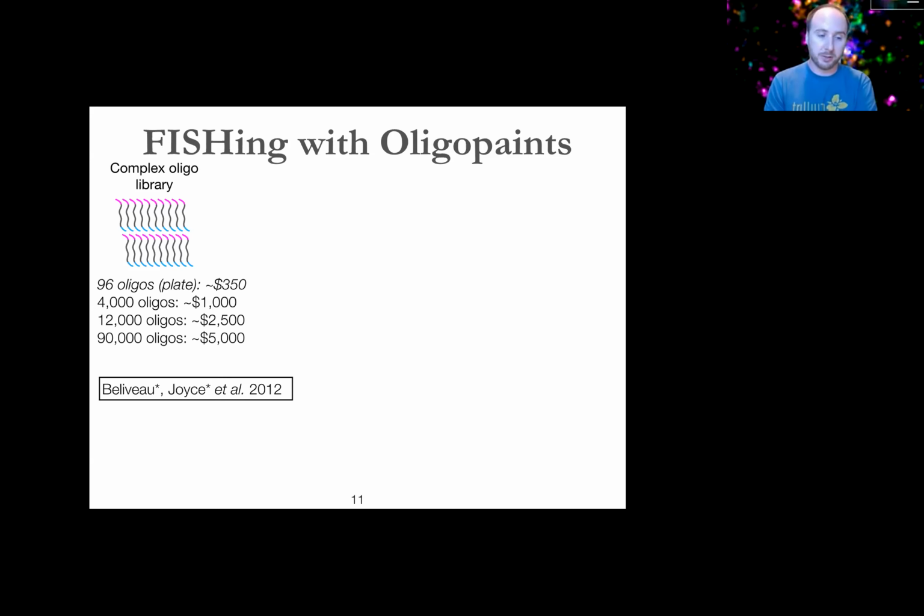The other options scale much better in terms of the number of oligos you can get per dollar. And so these are the array synthesis products I was mentioning. You can get anywhere from a few thousand oligos for around $1,000 up to, you can push if you want, beyond even 100,000 oligos. There are a few different companies now that'll sell you pools in this format. So the larger you make the pool, the cheaper in theory you're getting. The deal you're getting in terms of base pairs per dollar gets better.